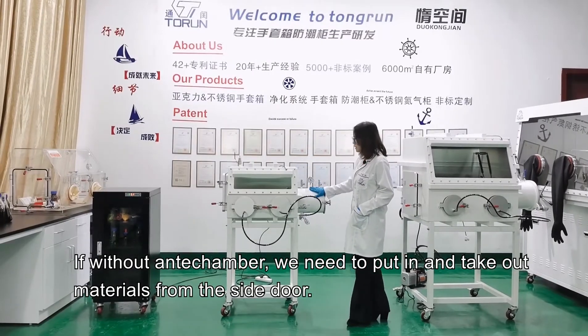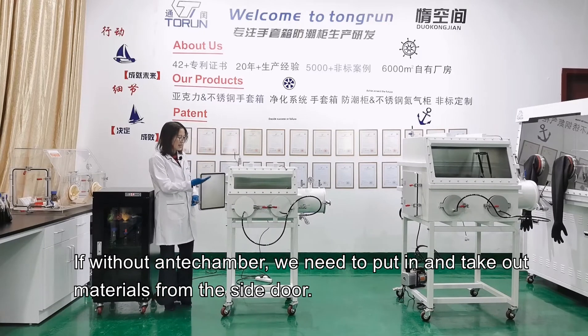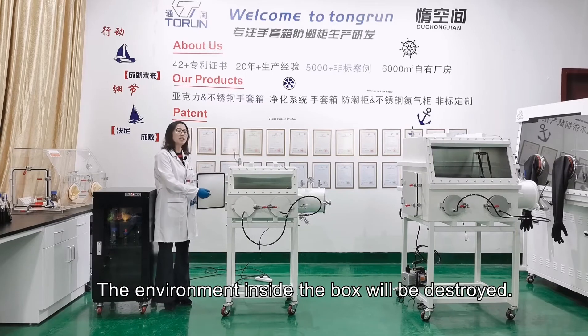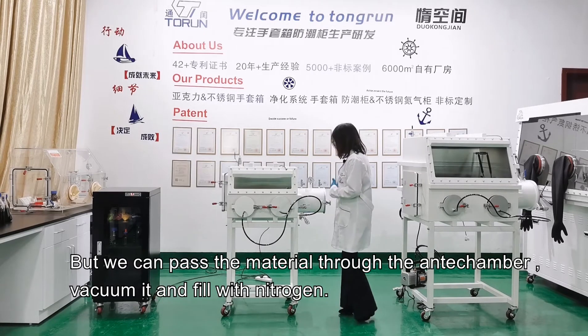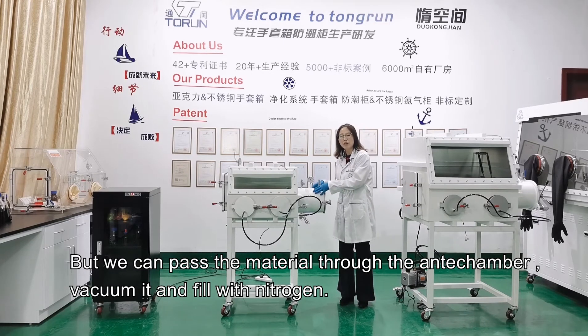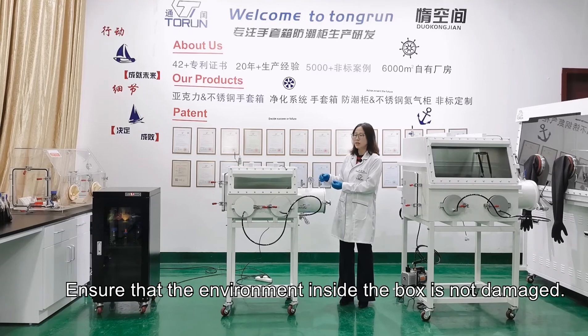Without an anti-chamber, we would need to put in and take out materials from the side door, which would destroy the environment inside the box and stop our experiment. Instead, we can pass the material through the anti-chamber, vacuum it, and fill it with nitrogen gas to ensure that the environment inside the box is not damaged.